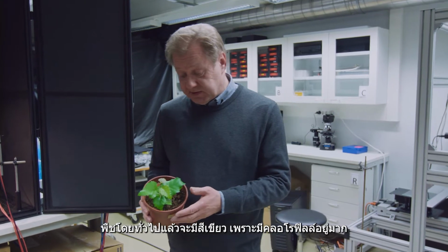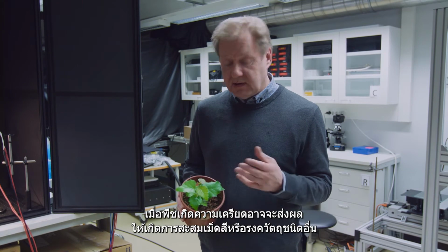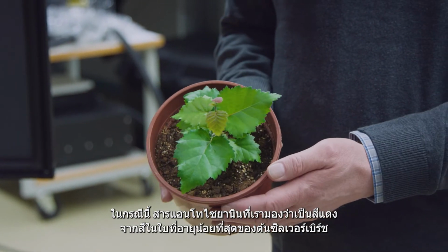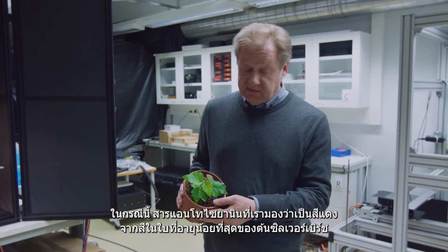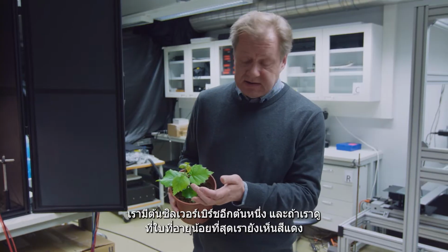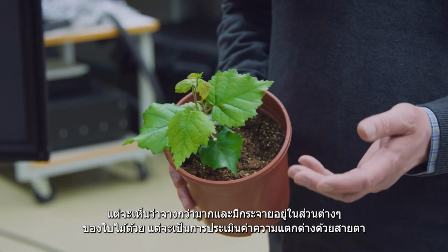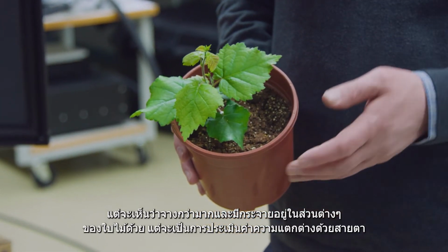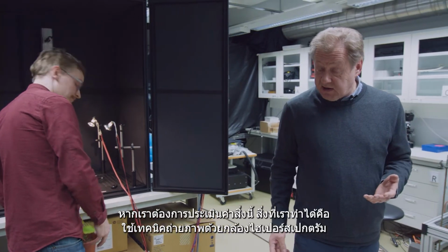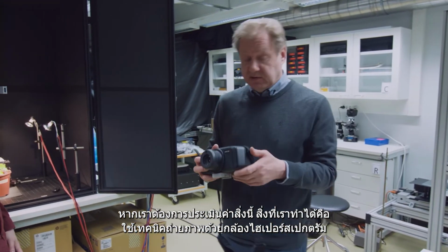Plants are normally green because they have a lot of chlorophyll, but when they're stressed, they might be accumulating other kinds of pigments. In this case, anthocyanin, which we see as a red color here in the youngest leaves of silver birch plant. We have here another birch plantlet, and if we look at the youngest leaves, we can still see the red color, but it's much more faint, and it's also present in some other leaves, but it's very difficult to estimate just by looking at it how much. How to find this out then is that we can image them with a hyperspectral camera.